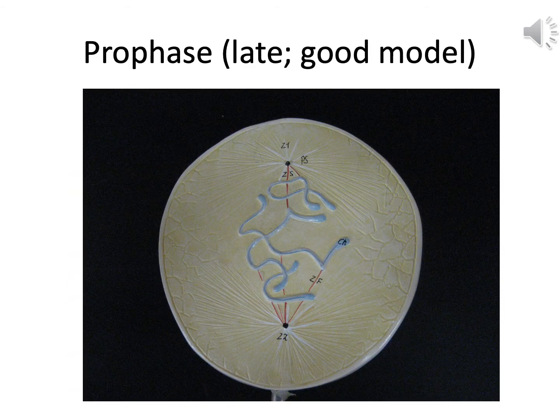The big thing that happens during prophase is the chromatin, the diffuse mass of DNA, coils to form visible rod-shaped chromosomes, the condensed DNA. This is where your 5-year-old is wadding up the cotton candy, so that you can see the individual chromosomes. On this slide, you can make out the gray-blue chromosomes, and you can actually see where they're at this time, rather than just being a pot of cooked spaghetti noodles. You can actually see individual noodles in there. The nucleoli, the red dot, has disappeared.